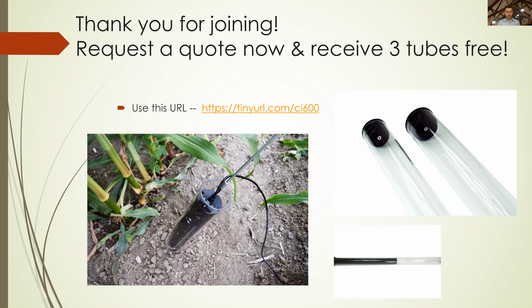The next question is, can the image analysis software recognize roots? Traditionally, it has taken a long time to manually select roots and measure the lengths in images taken at certain time intervals to get root growth. Again, we have developed the automatic selection a little bit, so you're able to start the selection and then just click automate, and it will continue on through the similar size pixels. Once the pixels get too different in their coloration, brightness, or intensity, it will stop. But if that is not exactly on your root, you can really quickly just point, drag it over, and it'll snap back into place.